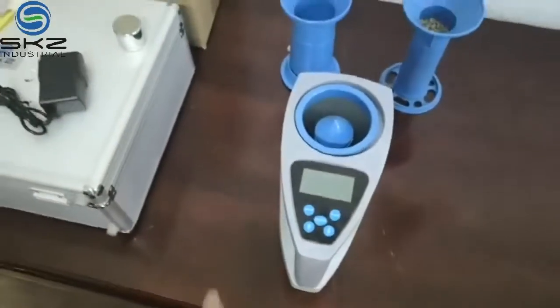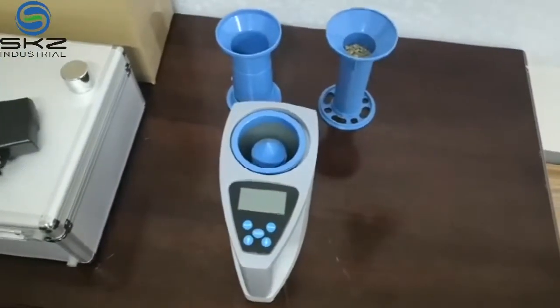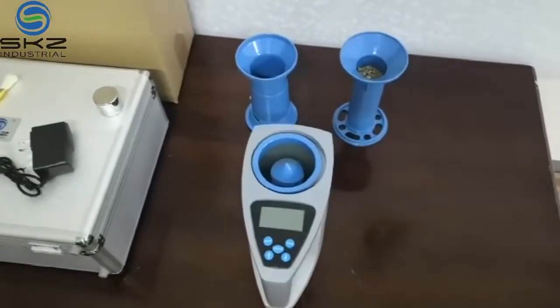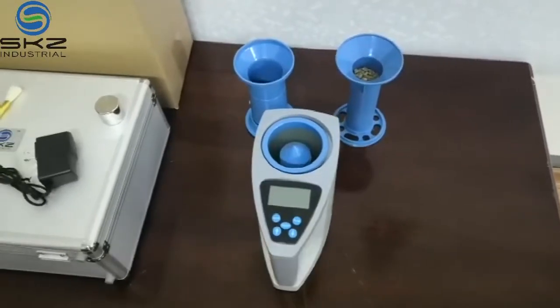This moisture meter can measure 33 types of material including coffee bean, fava bean, and others. The next step is to show how to operate it.